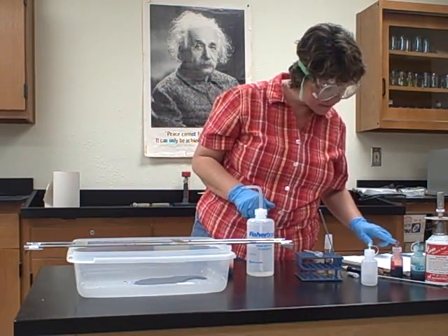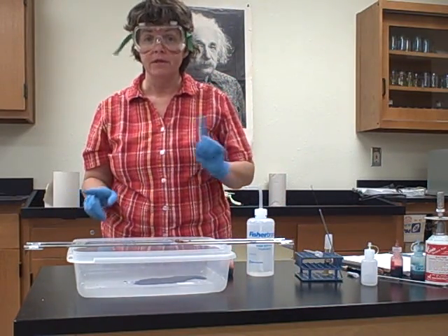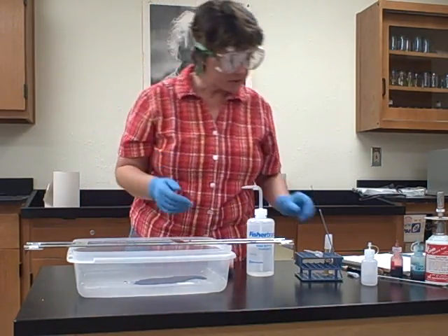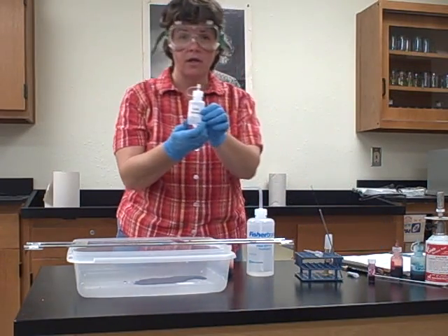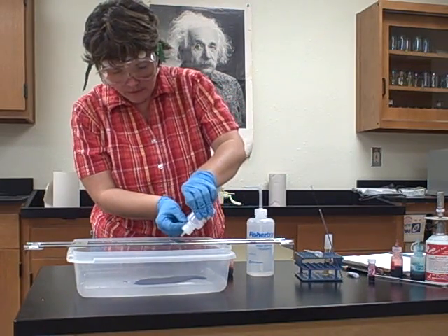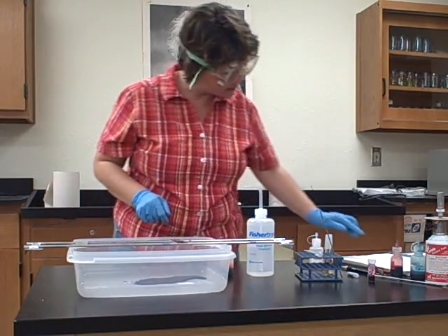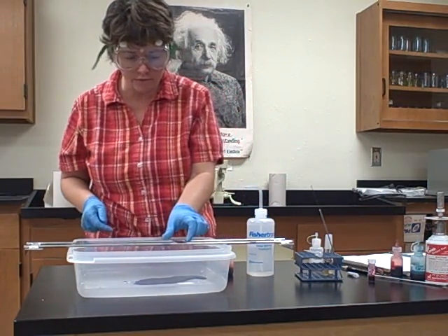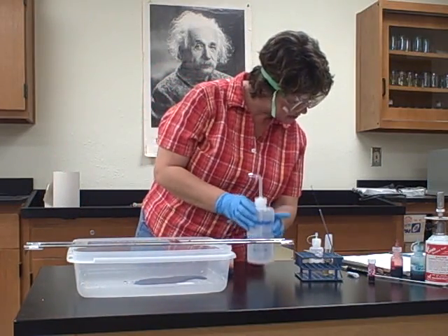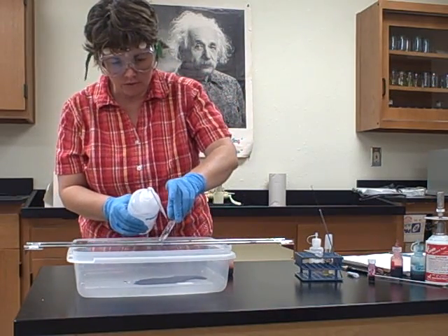And then it says fix smears with acid alcohol for 15 seconds. So did you see me heat fix that slide? No. This is one of the ones, also like the flagella stain, where you do not heat fix the slide. Okay, so now I'm going to fix it with acid alcohol, and it says for 15 seconds. Remember, this was already dry. So I wait the 15 seconds, and then it says, what color is your smear now? Well, it turned from red, now it's blue. Okay. So then we're going to let that sit for 15 seconds and then wash with distilled water.